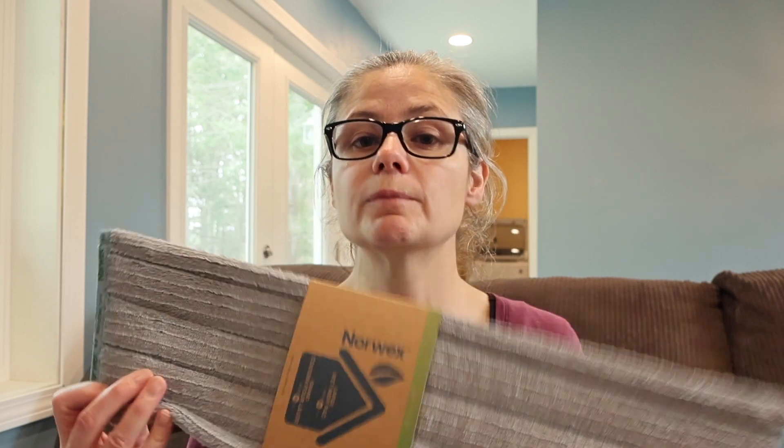What I am going to do is take some petri dishes and sterile swabs, and I am going to swab various areas on my floor. I will put those samples on the petri dishes and we will be able to see how much bacteria is on my floor before I even clean with the Norwex mop. Then I will clean with the Norwex wet mop just using water alone. I will swab the areas again and place those on petri dishes.